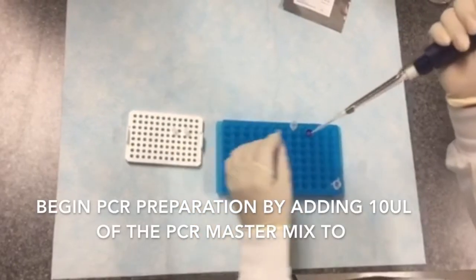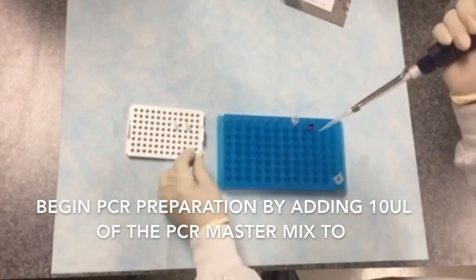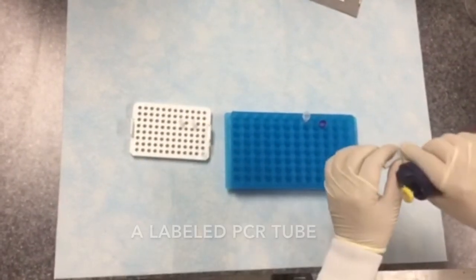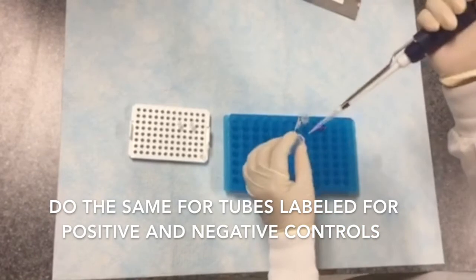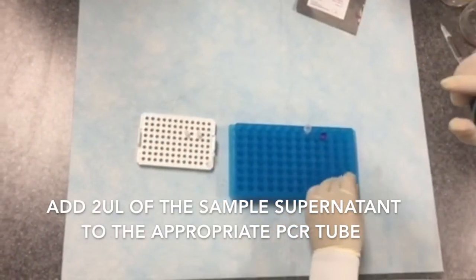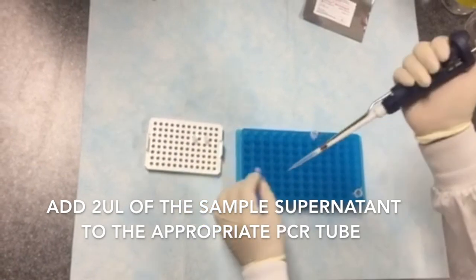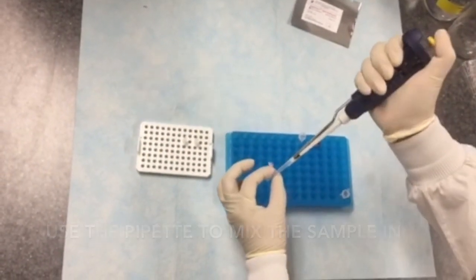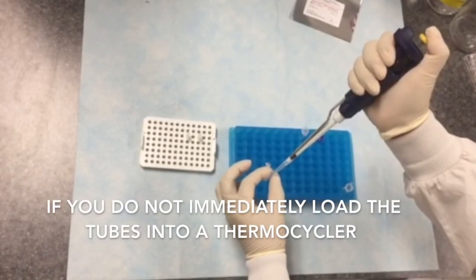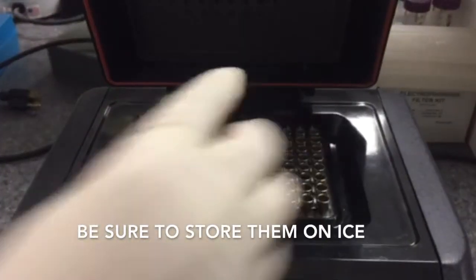Begin PCR preparation by adding 10 microliters of the PCR master mix to a labeled PCR tube. Do the same for tubes labeled for positive and negative controls. Add 2 microliters of the sample supernatant to the appropriate PCR tube. Use the pipette to mix the sample by pipetting up and down. If you do not immediately load the tubes into a thermocycler, be sure to store them on ice.